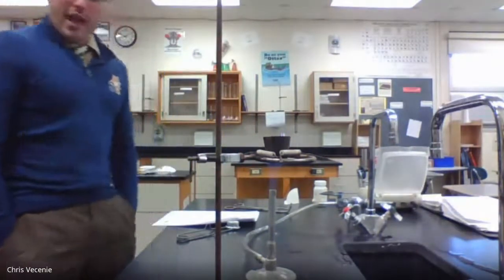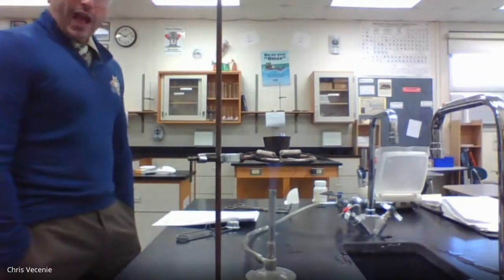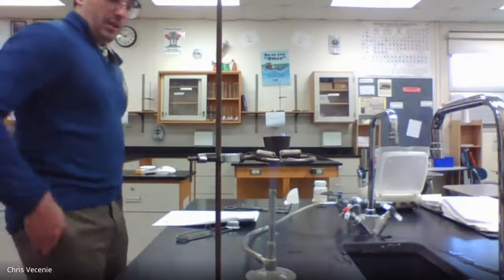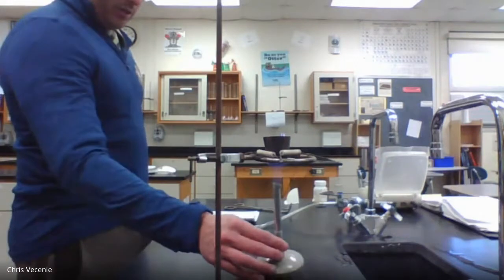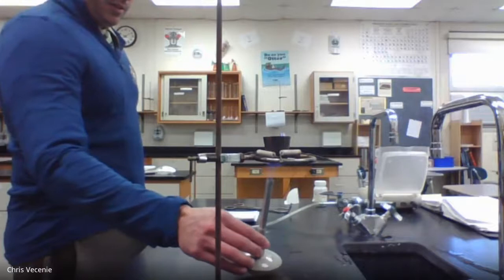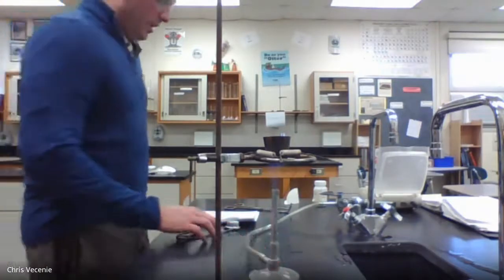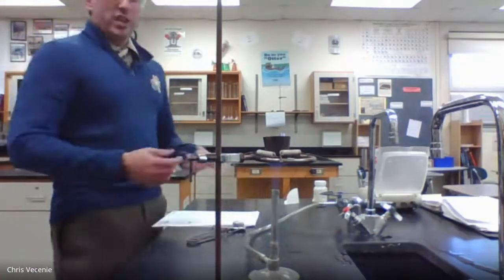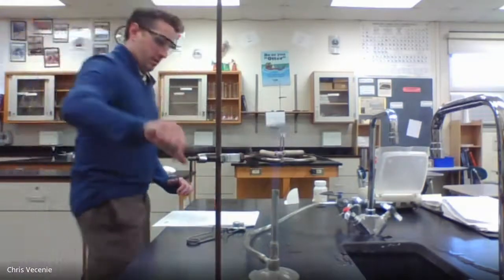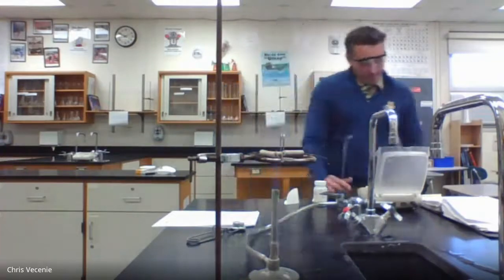And all we're doing right now is prepping. We're prepping the M2CO3 for the reaction with the calcium chloride. Every once in a while, just move that flame, brush it. All right, and there's my 2 minutes. So I'm not going to shut my burner off this time because there's a chance I have to come back up on it. So I'm going to go over here, bring this over, and then I'm going to get my number.